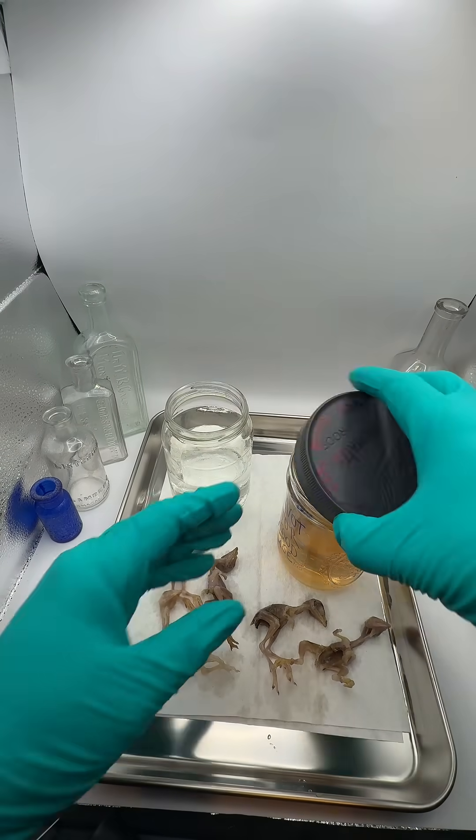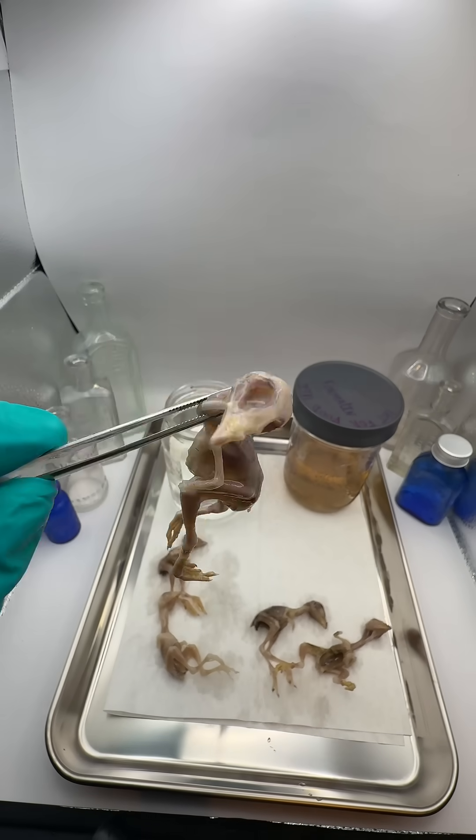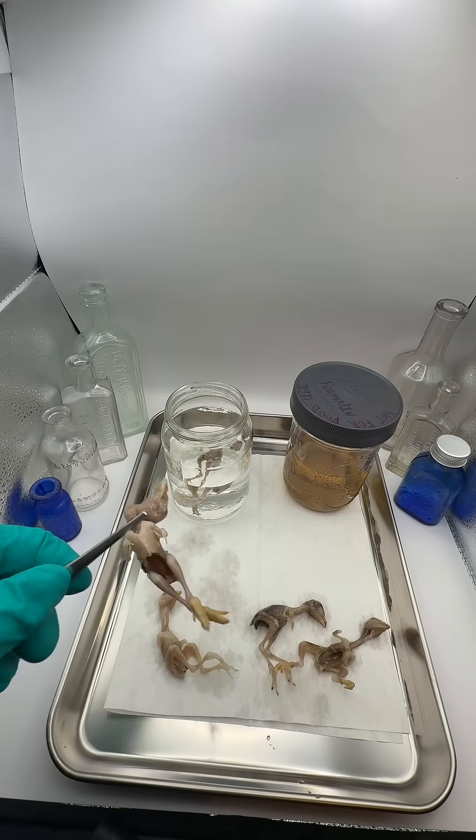Online, it also says that you don't want to leave them in the formalin too long, because prolonged fixation can cause things like chromatin breakdown, faint or irregular staining, or a decrease in the reactivity of certain antigens.